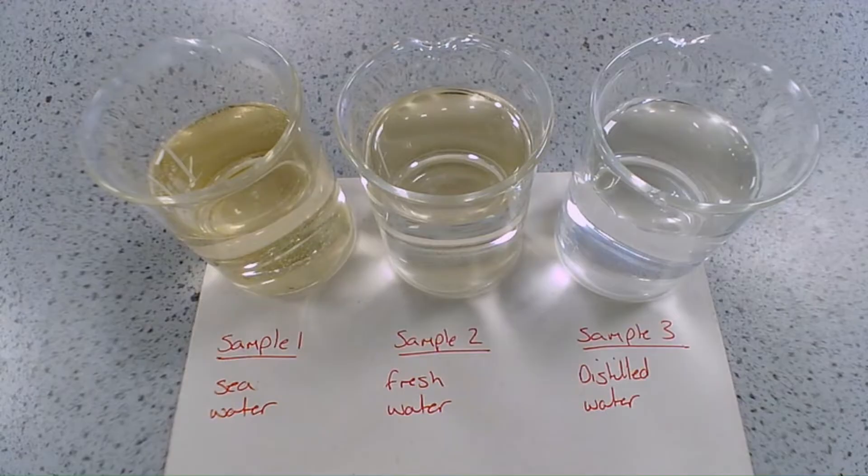In this required practical we're going to look at three different samples of water: sample one, sea water; sample two, fresh water; and sample three, distilled water. We're going to look at a method for measuring the pH of these different samples of water, a method for determining the mass of dissolved solids in these samples, and also the method for obtaining distilled water from seawater.